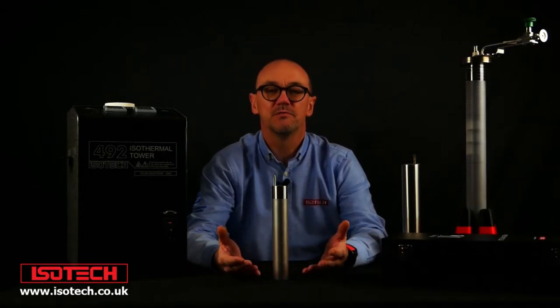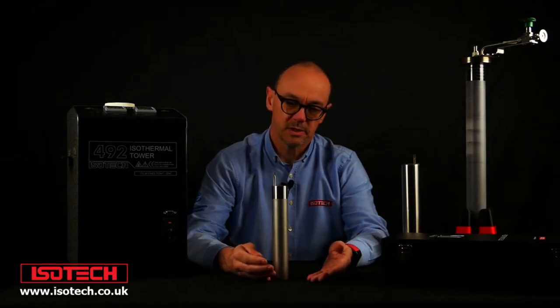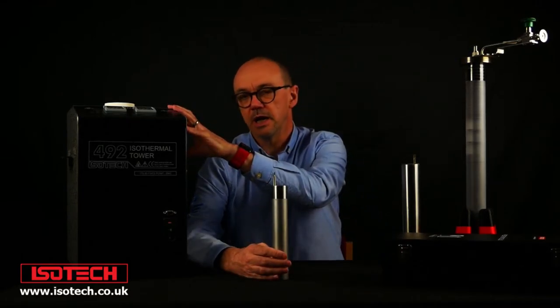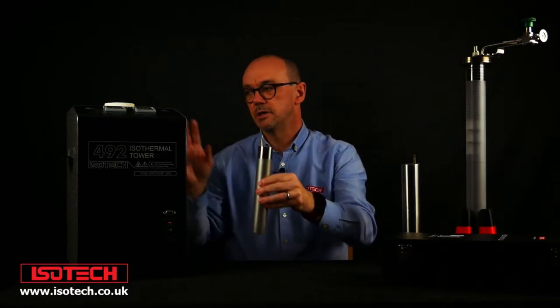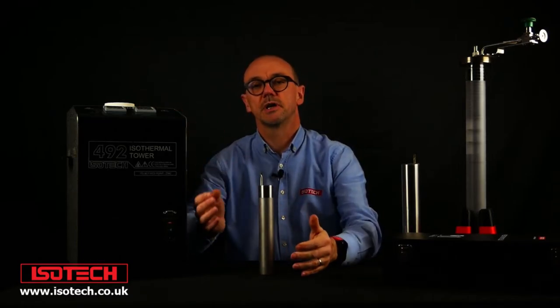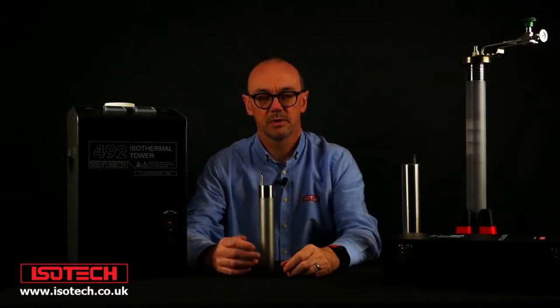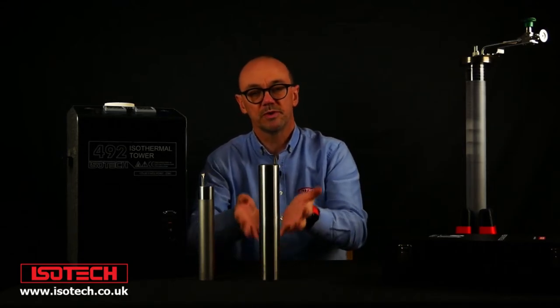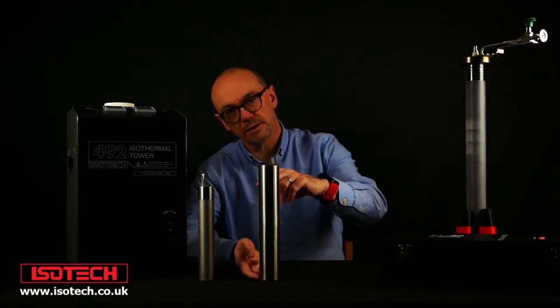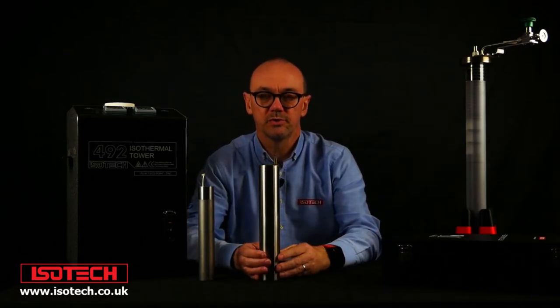As I mentioned, there are quite a few different types of ITS-90 fixed point cell. This is a metal clad cell and we call it a slim cell — we use that in some apparatus. This is a product from Isotech called the ISO tower, which combines a heat pipe and furnace with the cell into one integrated device. We can use the ISO tower as a standalone system to calibrate at the ITS-90 fixed points. There are also larger cells — we call this our optimal cell. It's the same as the slim one but physically larger. The benefit is there's more metal inside, so the thermometer is immersed more deeply and we can get a lower calibration uncertainty.